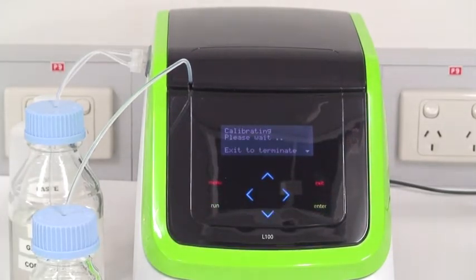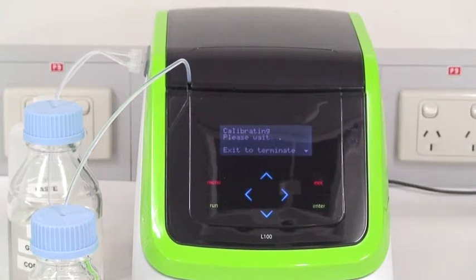When calibration is complete, the M value is displayed. If it is within specified limits, the sensor is healthy and the L100 is ready for analysis.